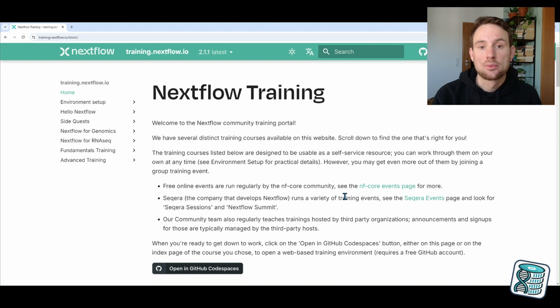And then the second part, we will actually see a Nextflow workflow, which is designed to pull data sets directly from our ReadStore databases so that we can integrate both together and use the power of ReadStore to actually manage your data while using Nextflow to execute and build bioinformatics workflows on top of this.